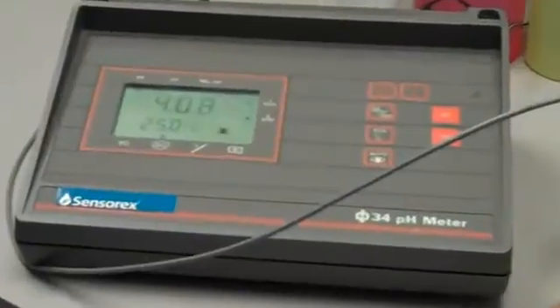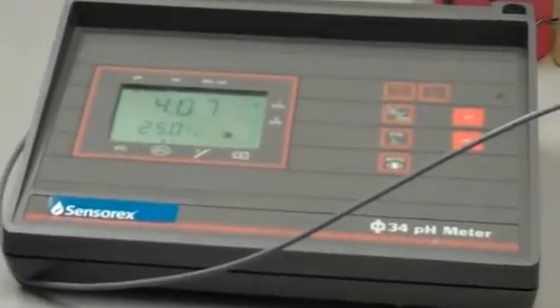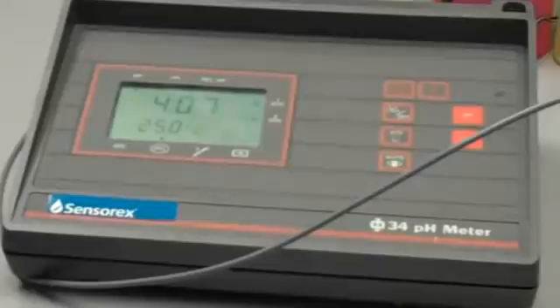Now, I'll once again hit the standardized button on my pH meter. The pH electrode should lock into a pH value of about 4.0.